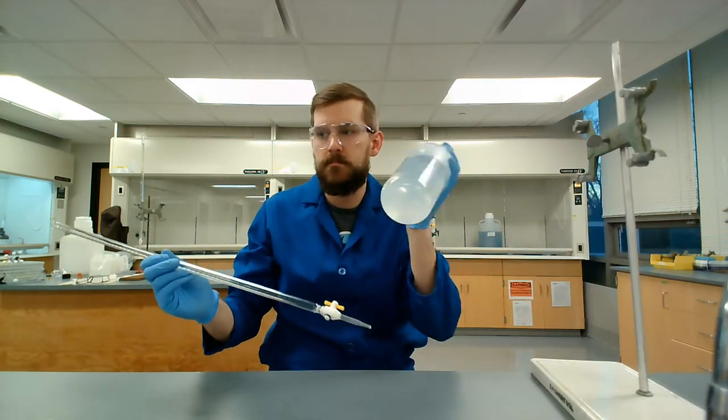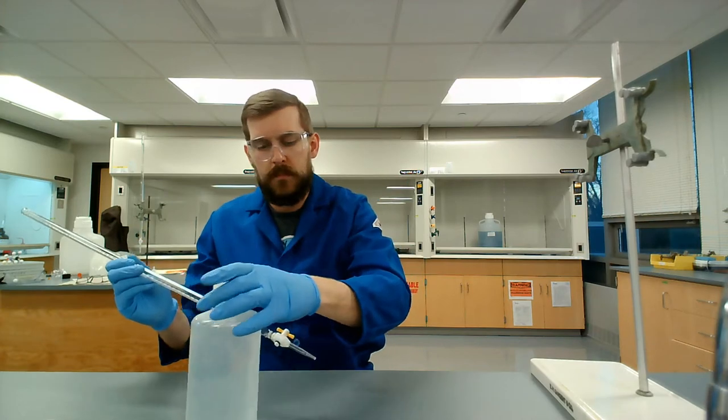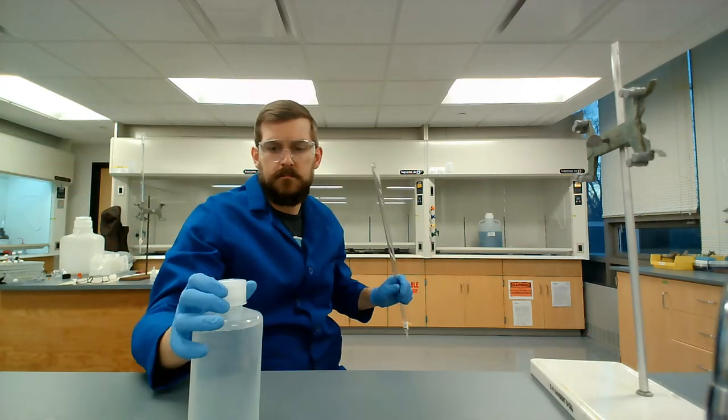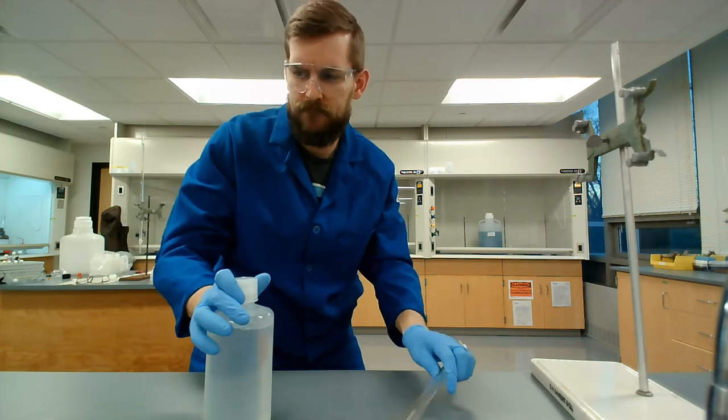And now I'm going to fill it with our sodium hydroxide solution. Prior to doing this, I'm going to make sure that I actually close the stopcock so I don't drain sodium hydroxide all over the floor and my shoes.